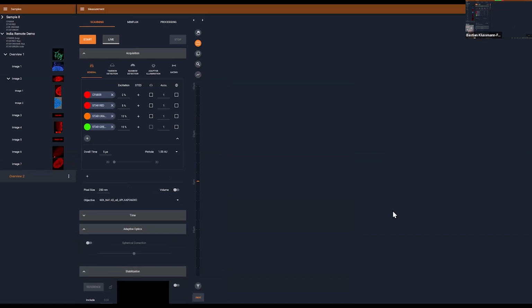And of course, there are more fancy applications for fluorescence lifetime, for example, like FLIM-FRET and things like that. But to be honest, most people use fluorescence lifetime imaging for dye separation of spectrally identical dyes. So you can use lifetime information of dyes to increase the number of channels you might have in your sample.